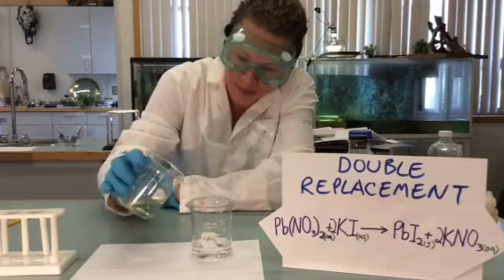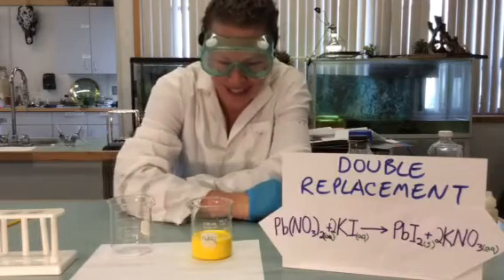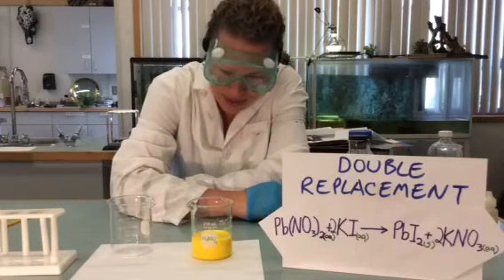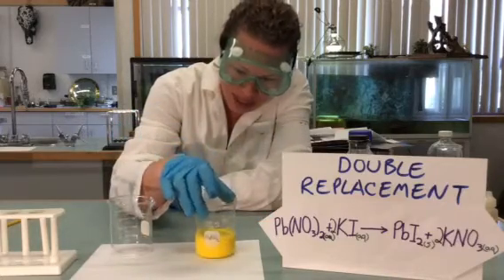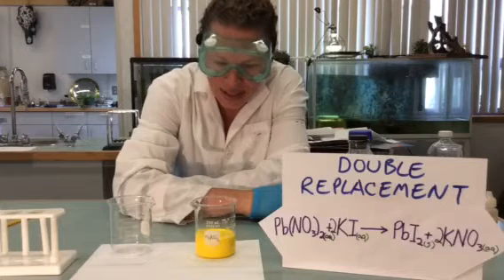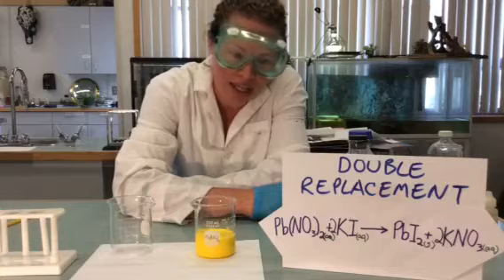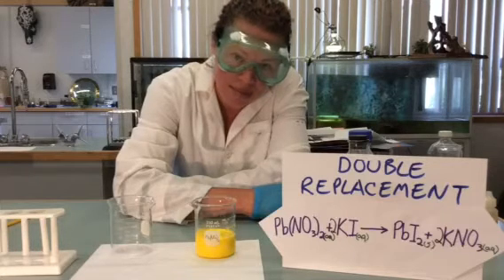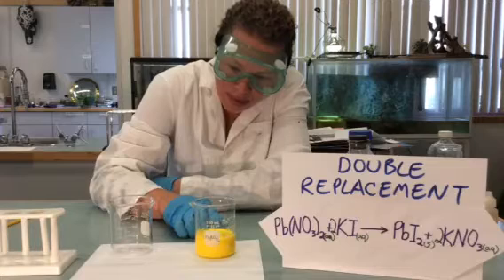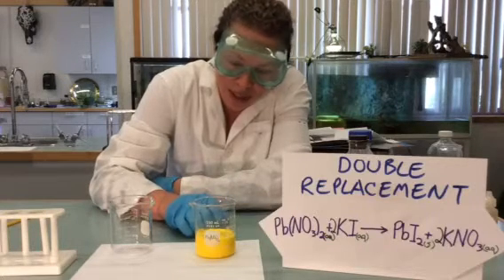It means that they are dissolved in water. So when I add them, ooh, that's fancy. So what we see here is this is opaque. And the reason why it's opaque is that there's actually a solid precipitate that has formed. You can see from the reaction that lead iodide, which has now formed and is the yellow stuff, is a solid.